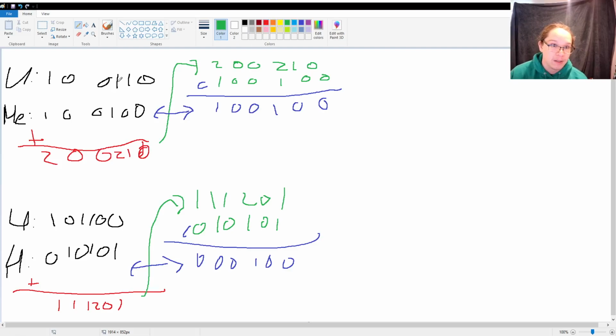Up here, we can see that they agree here, and they agree here, and we only care about the color, right? Here, they disagree here and disagree here with color, but agree here. And that's why we see a 1 here. In these other positions, because they don't agree, we see a 0. Because these two arrays are not equal, then we know our unknown doesn't have hydrogen.